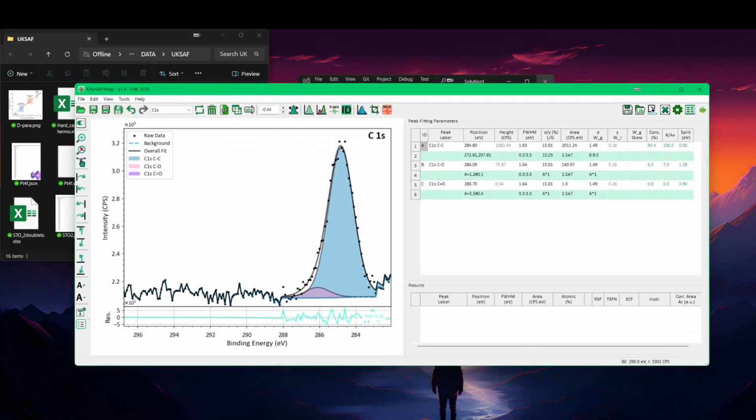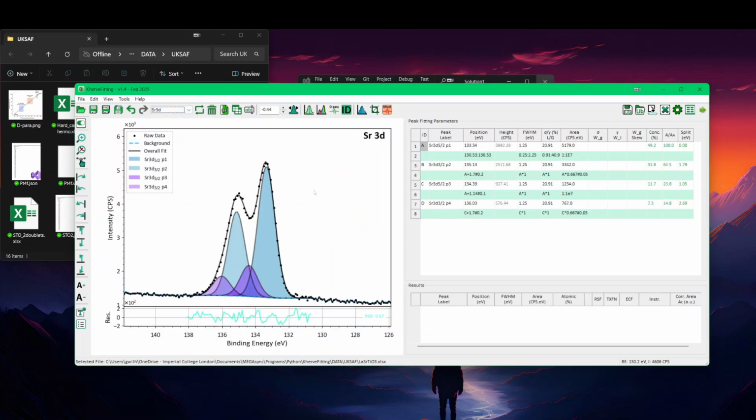I can't see it now, but you can add a label if you like. You can toggle the data. So maybe that's something quite nice to talk about. If I go to strontium, here we have 4 label shows, and you can hide some of the values. For example, now I do not want to have the second part of the first doublet shown, this 3/2. Then you create a one-word label. If you just delete the space, that will create one word, and now it is hidden from the label.